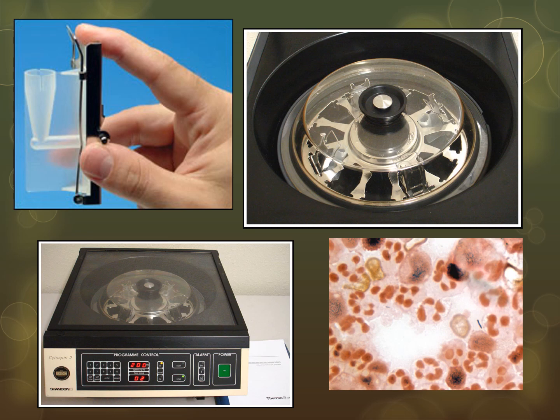So the outside of the cytospin looks like the bottom left-hand picture, and the inside looks like the bowl that's on the upper right-hand picture. On the upper left-hand side, you can see a funnel with a spring, and what you don't see there is that there is a slide sitting behind that funnel in that metal encasement. What you do is put 4 to 5 drops of spinal fluid in that funnel, and then you put the funnel with the slide in the centrifuge and you spin it down, and what you end up with is a concentration of cells in a small circle on the slide. So that's the cytospin. Really good for sterile body fluids where there's not a lot of cells or bacteria.